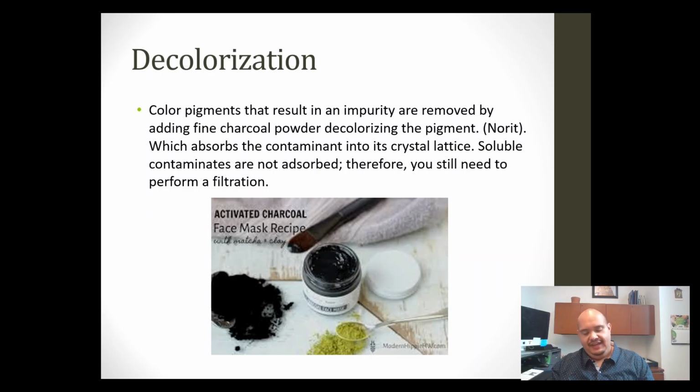And then you put it on the counter and let it cool to room temperature. It will start to seed and to scaffold. If it doesn't, agitate with your glass stir bar on the bottom of the glass beaker to get the seeding to induce. You can try to put a little ice if you have to. If you're using ethanol, that's totally okay. Don't use too much. Less is better. And you take that beaker, put it into an ice bath, get the rest of the seeds going and get the yield up as high as you can, and then put that onto your vacuum filter.